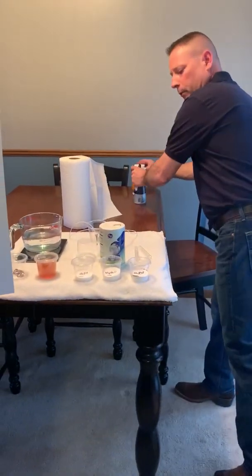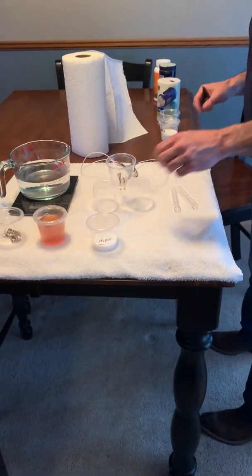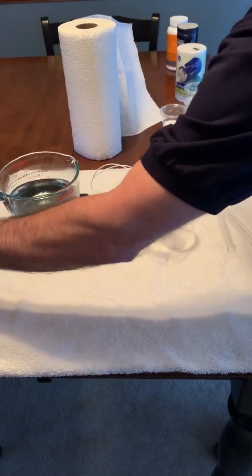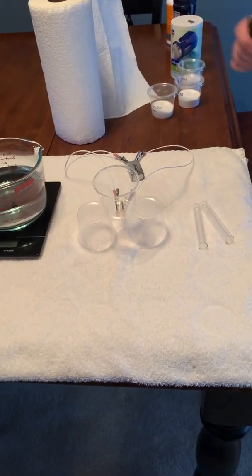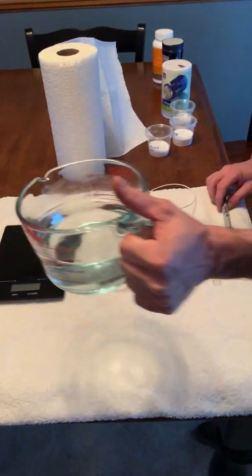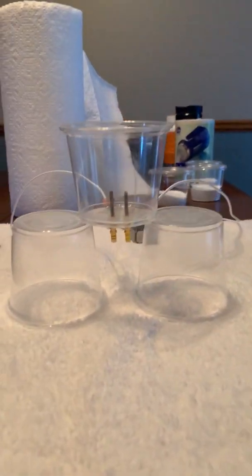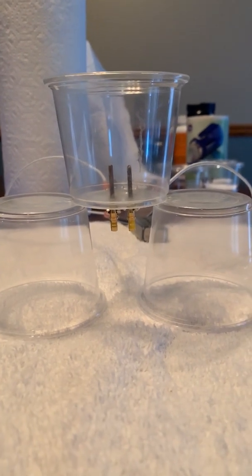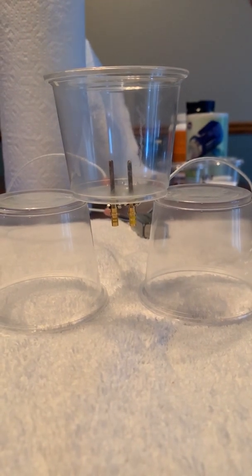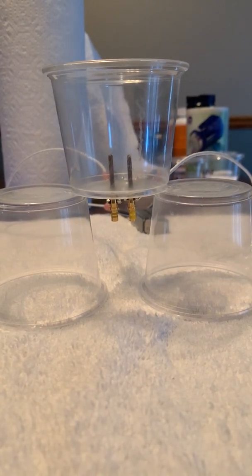So basically what's going to happen is the hydrogen atoms are going to gather on the cathode, which is the negative part of the battery. The oxygen atoms are going to gather on the anode, which is the positive side of the battery. So this is my solution, and we'll pour this in, and you'll see the bubbles come off the electrodes. That's the hydrogen and oxygen gas being broken apart. It's the water being broken apart into hydrogen and oxygen gas through the electrolysis process by a chemical reaction called redox, which is reduction and oxidation.